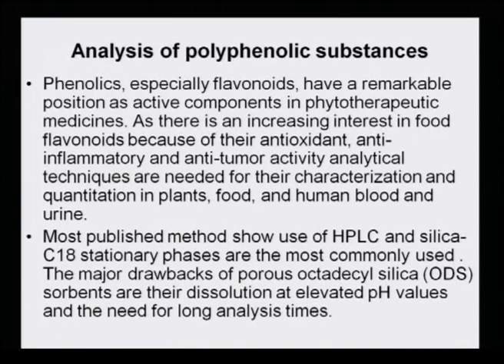Analysis of polyphenolic substances. Phenolics, especially flavonoids, have a remarkable position as active components in phytotherapeutic medicines, as there is an increasing interest in food flavonoids because of their antioxidant, anti-inflammatory and anti-tumor activity. Analytical techniques are needed for their characterization and quantitation in plants, food, and human blood and urine.